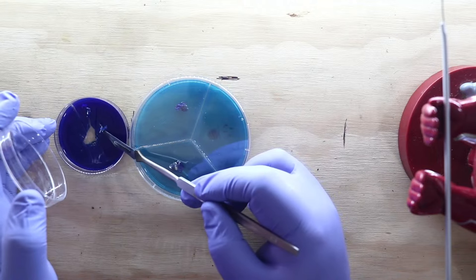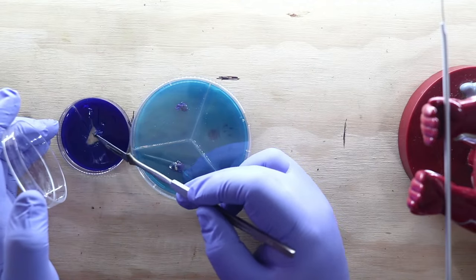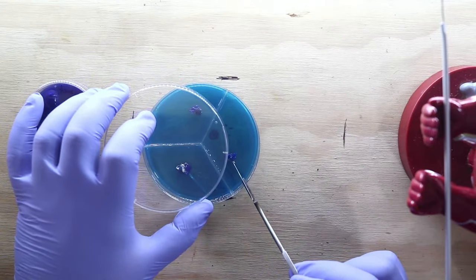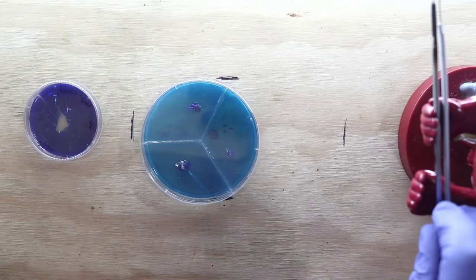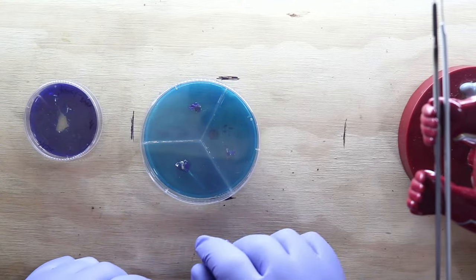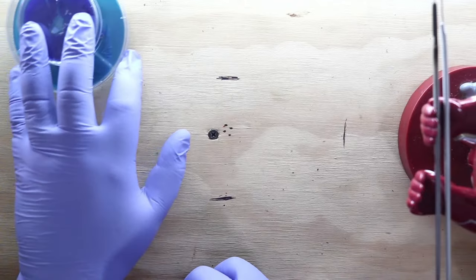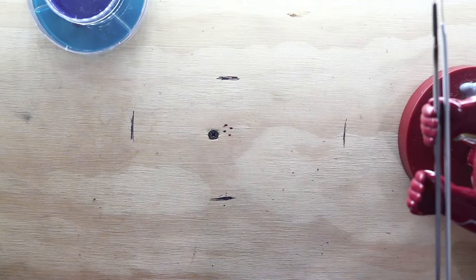One more transfer, and I'm going to just collect these little rhizomorphs here. And then I'm going to leave the rest of the rhizomorphs that are embedded in the agar in this dish, close it back up, and see if they come back together or grow a new network. Alright, now I'm just going to set these aside. And I'm going to take them and wrap them in parafilm here a little bit later at the end of the show. So, that's that.